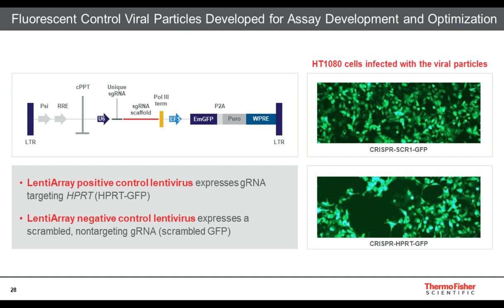An additional application of flow cytometry would be using flow cytometry to optimize your viral workflow. So if you're running a screening application or need to optimize your MOI, there are a lot of different ways that flow cytometry can come in handy here as well.